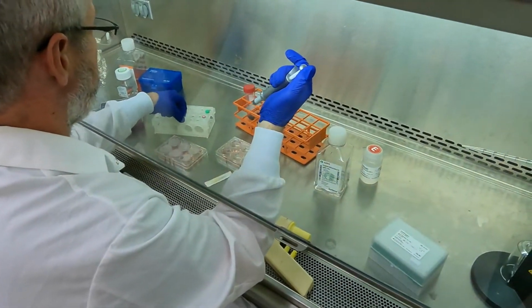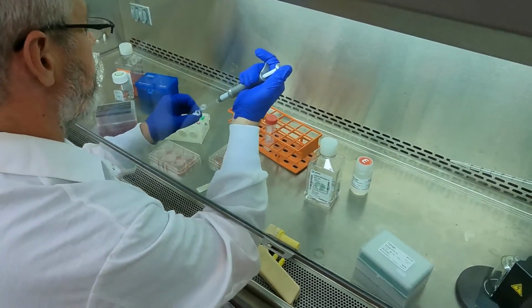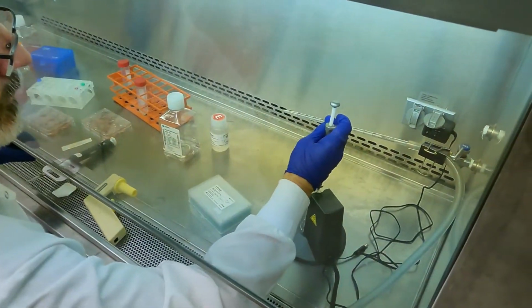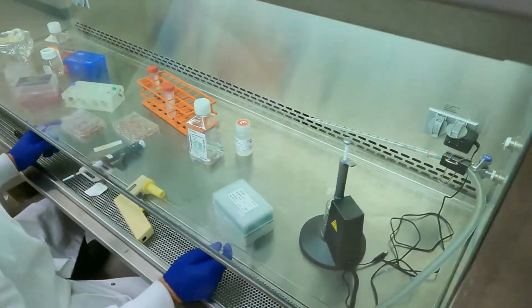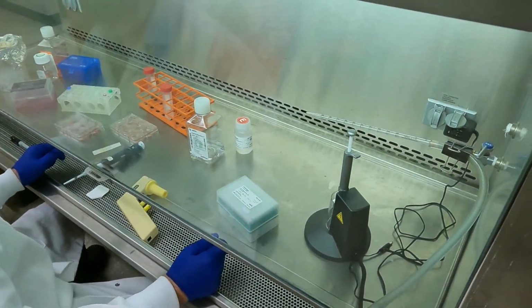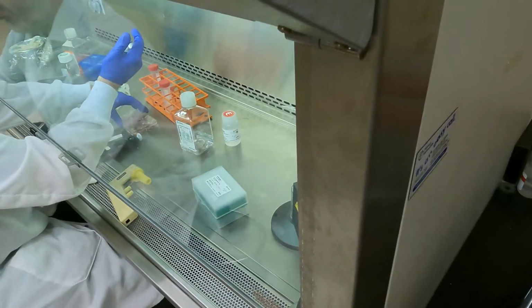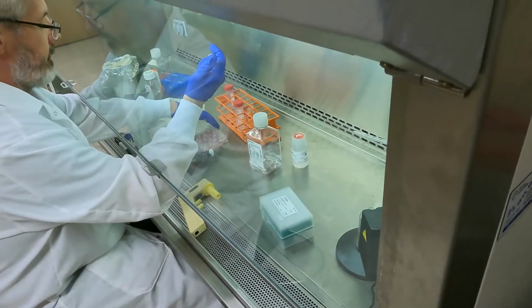Next up, just go as quick as you can and try to reuse everything. If there's a misfire, you can always mark the well that's misfired and not use that. Good? Thank you, Tommy. So Tommy's just pressing the button for me.